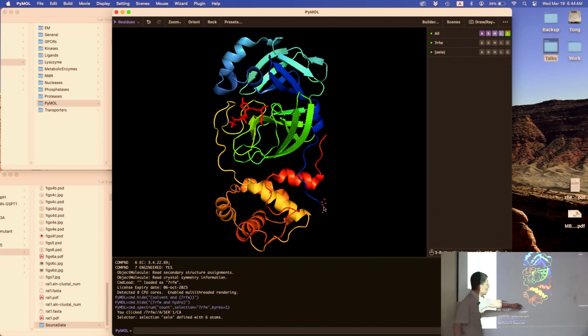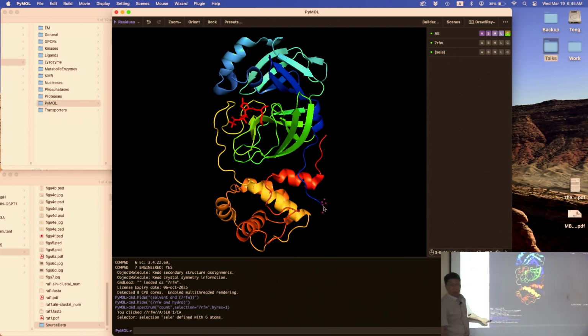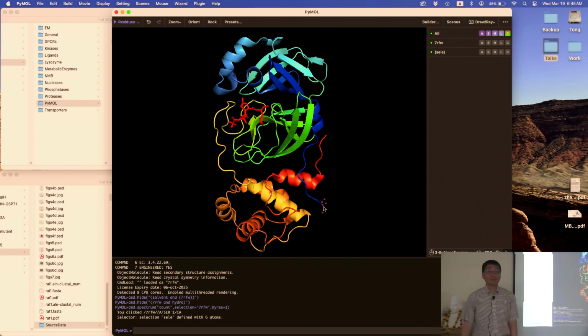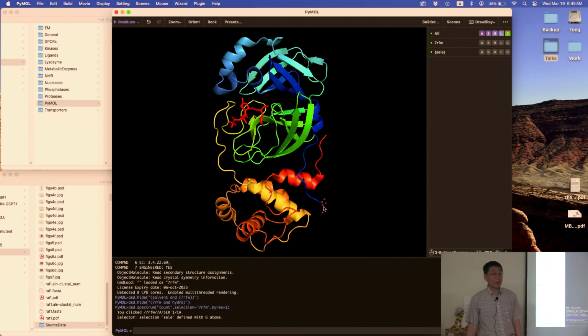You mean just click on here, right? It should echo what you did down here in your command line, the command window. And then it tells you which one you clicked. You see that? You got it?